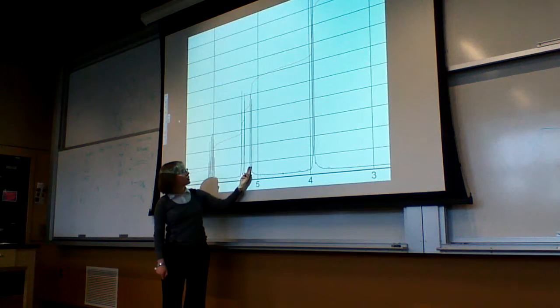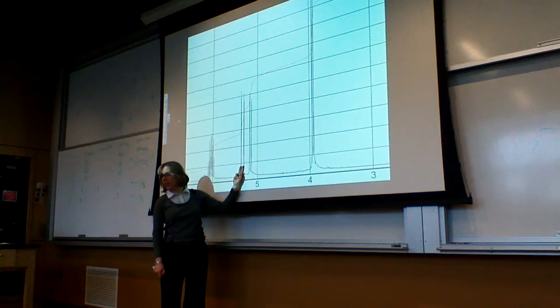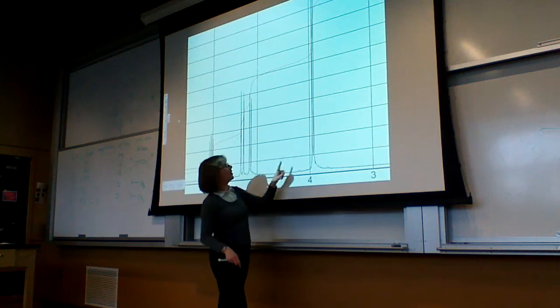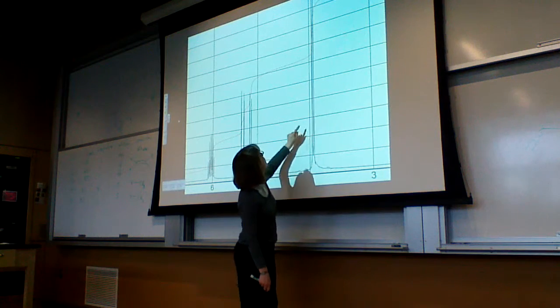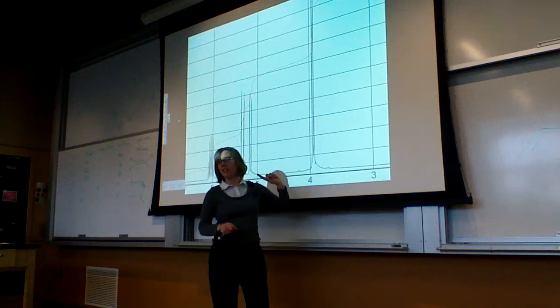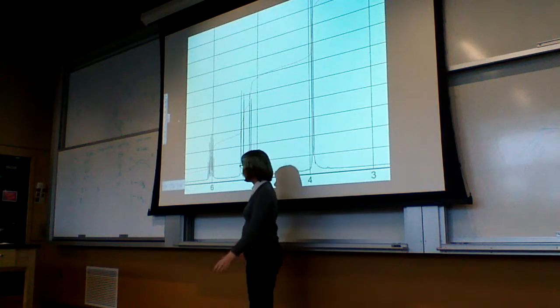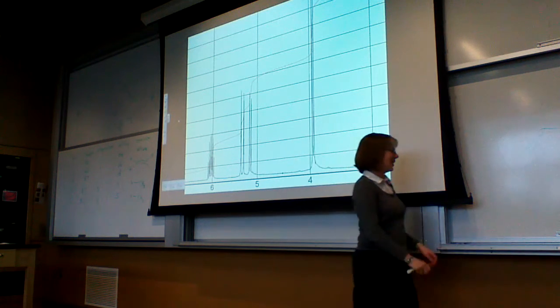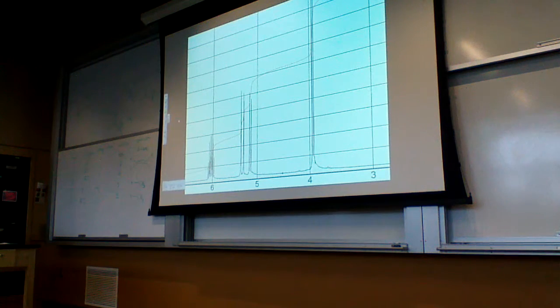Note that these peaks are closer together than these two, so they have different coupling constants, so we know they're not splitting each other. And they have an even different coupling constant than that one. So we know that all 3 of these doublets are not splitting each other. They all happen to be splitting the one at 6, and that's why we get the craziness of that peak. This corresponds to C3H5Br.